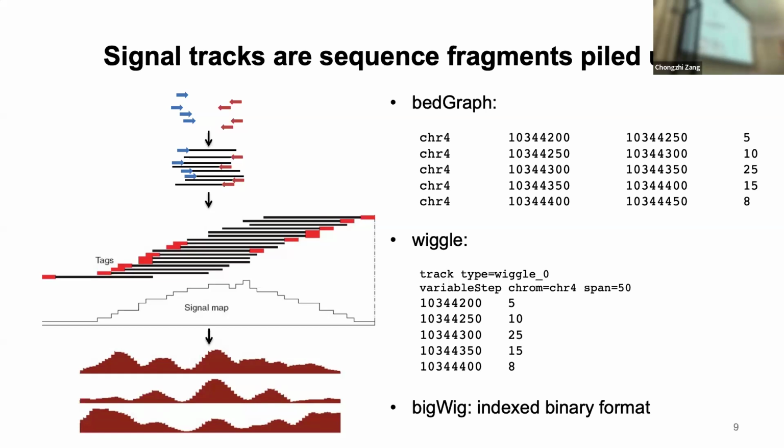When do you decide what type of data you want to send in for sequencing? You have to make that decision when you send the sequencing, whether you want single end or paired end, depending on the specific type of experiment. Usually for RNA-seq, either single end or paired end should work.